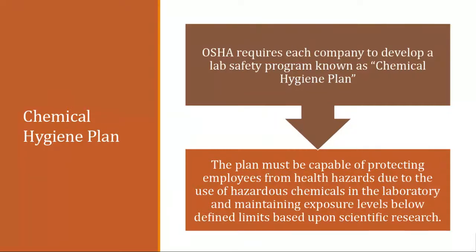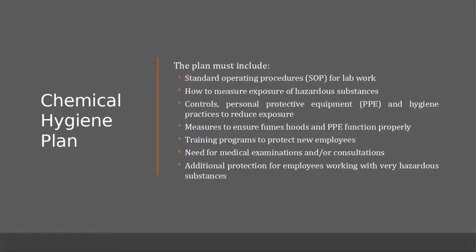But first, one of the things that we have on our end is a chemical hygiene plan. And this plan is to protect any of our employees and students from health hazards. And those are typically done when you're looking at your standard operating procedures. So when you're working in the lab, especially when signing up for Open Lab, you'll have the opportunity to create a standard operating procedure for whatever methodology you're going to be going in the lab for. And that helps protect you, because you're going to be writing that up so everybody knows your plan.